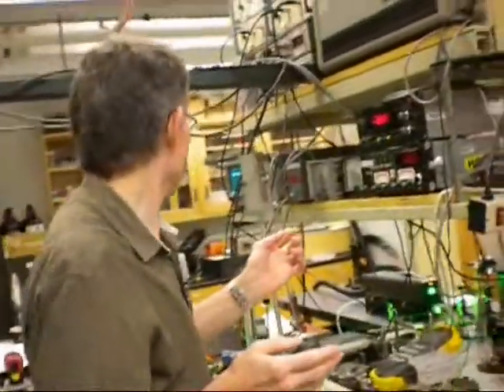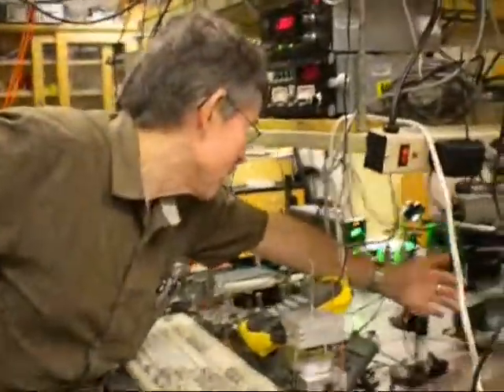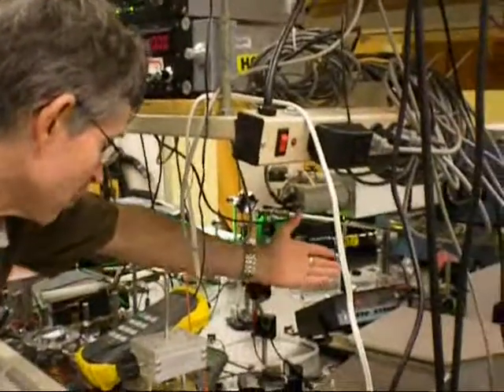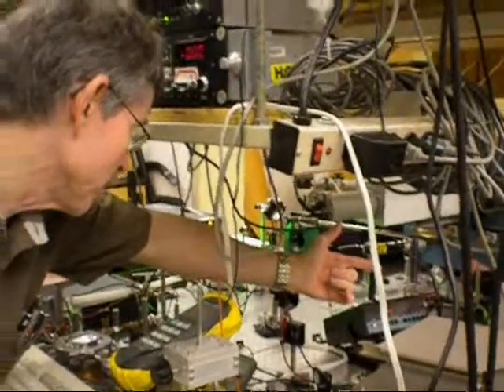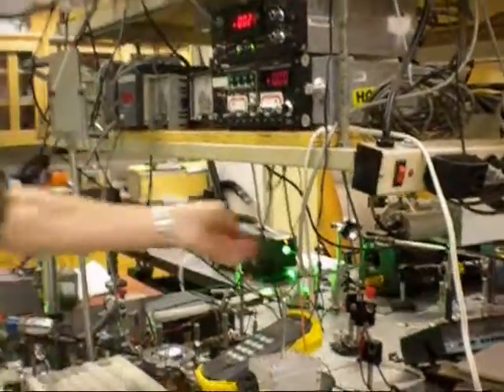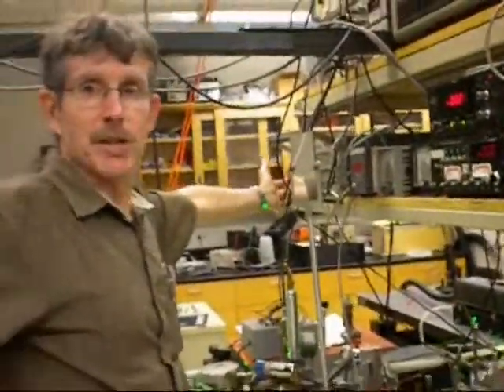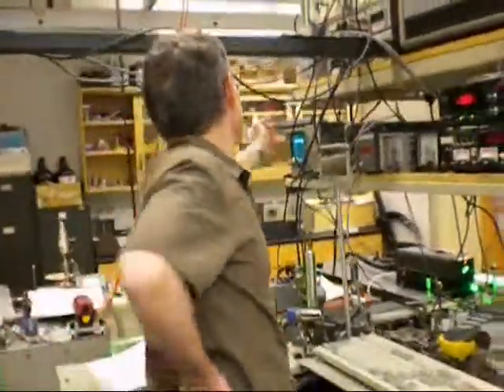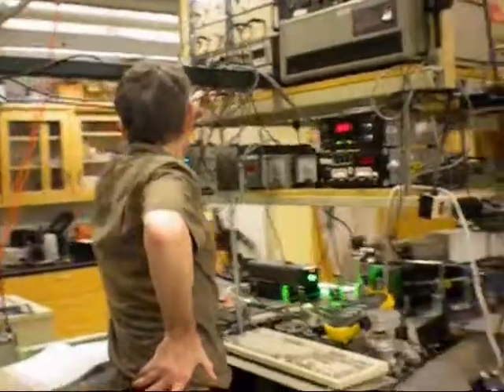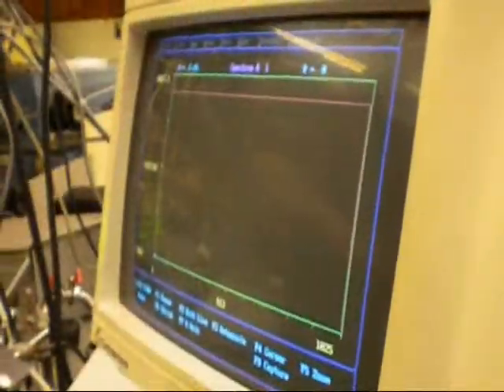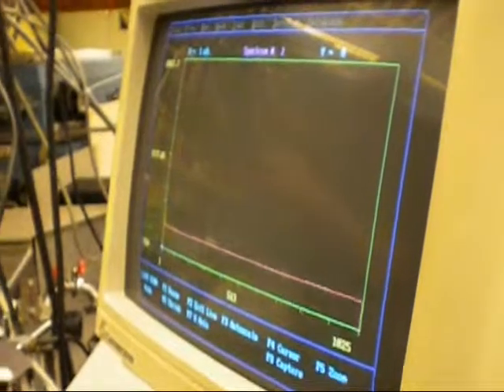So all I'm doing now is trying to... Part of this optical path, there is a mirror that deflects a portion of the beam into a photodiode, and that's what this display is showing, the output from that photodiode. Let me change something here so that we can still see something like this.